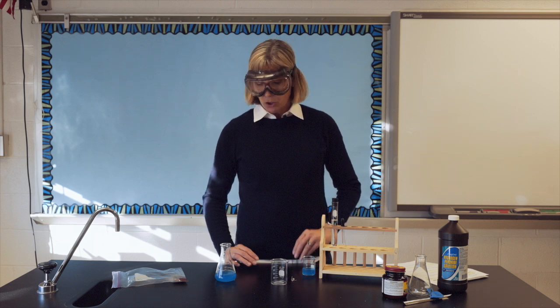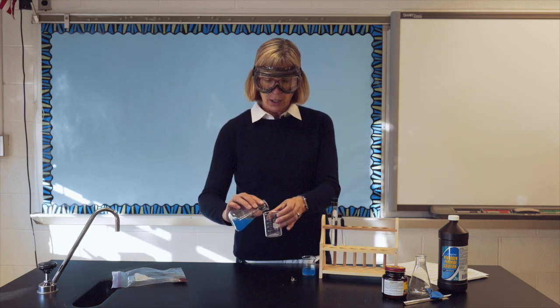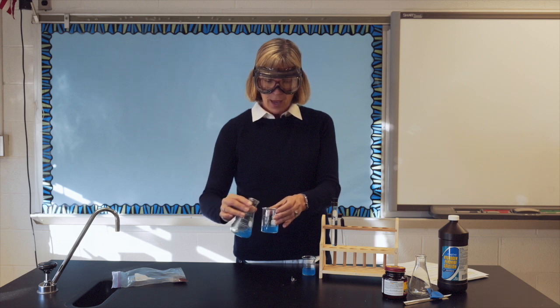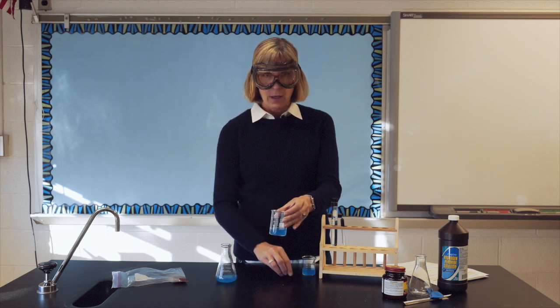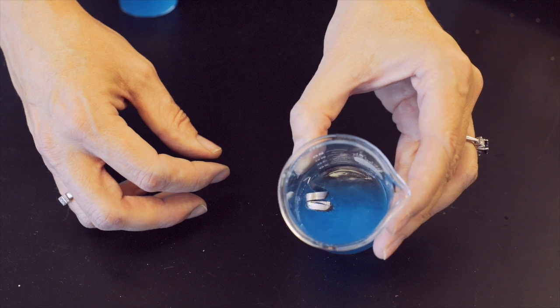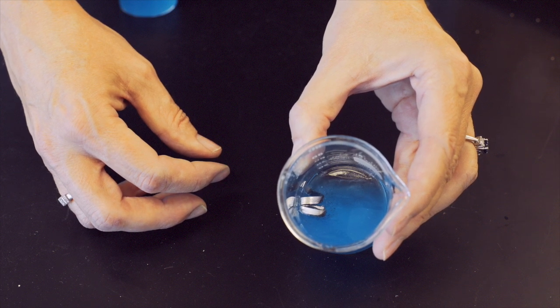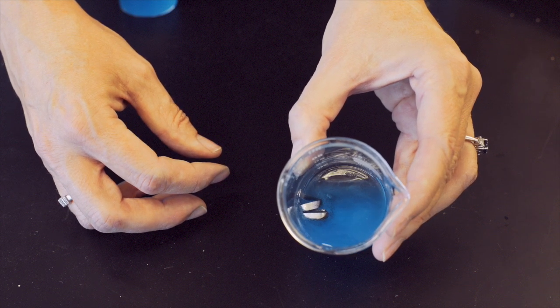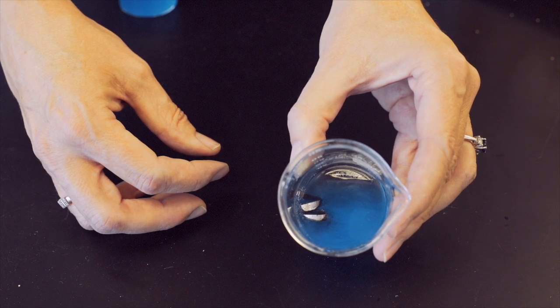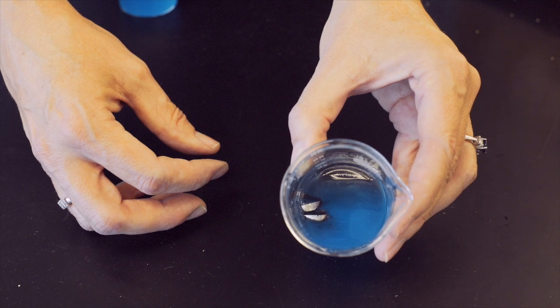Activity B instructs you to put 20 mLs of copper sulfate into a small beaker and then add a piece of magnesium metal. Notice the small bubbles. As the reaction progresses, notice also the color change of both the liquid and the metal.